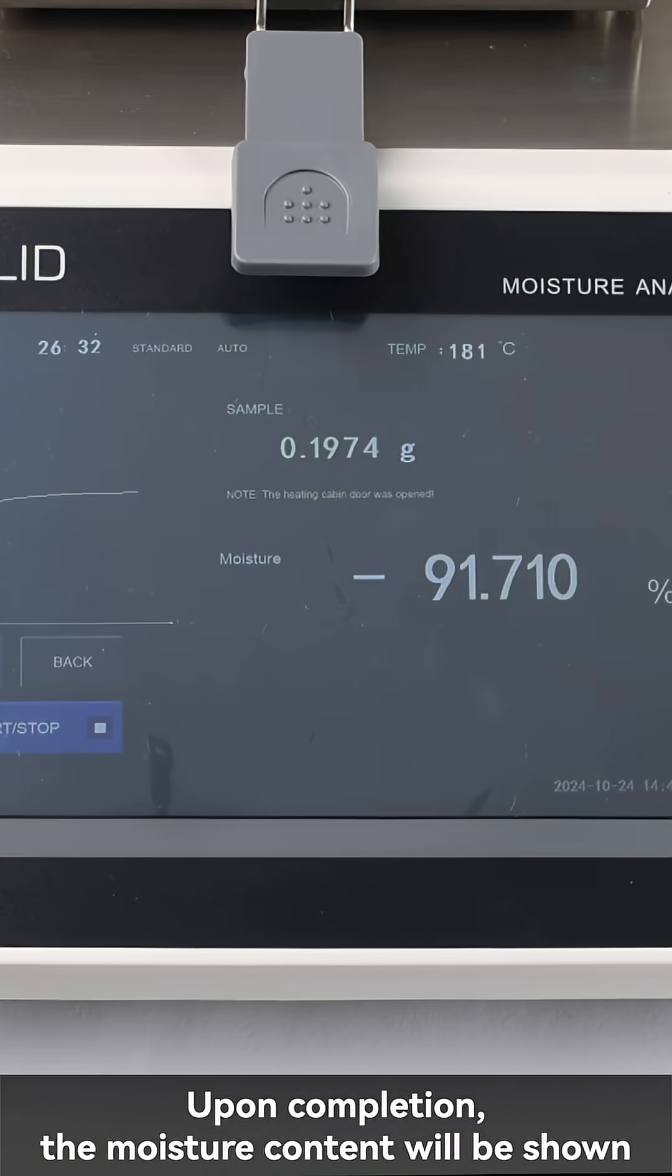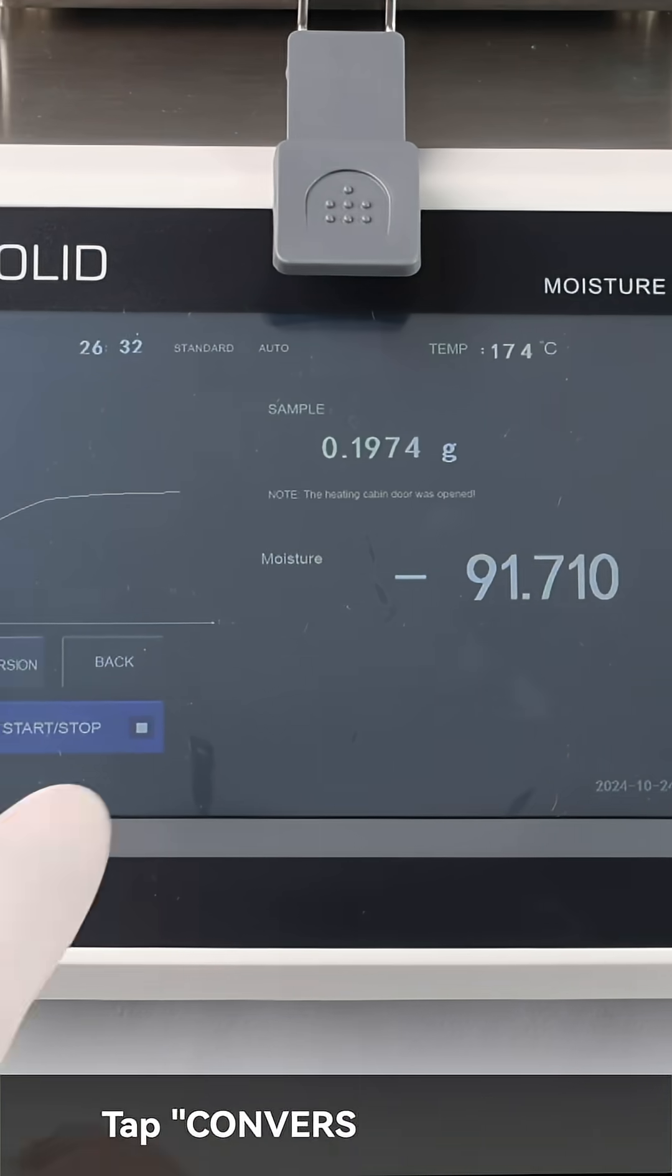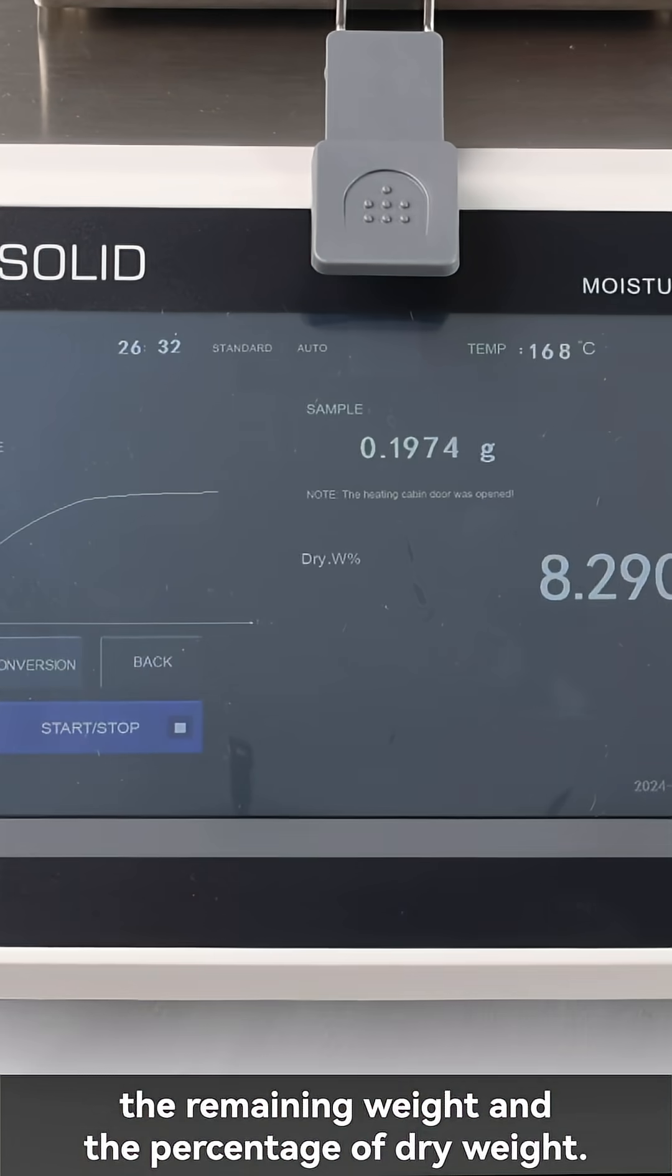Upon completion, the moisture content will be shown. Tap conversion to view the remaining weight and the percentage of dry weight.